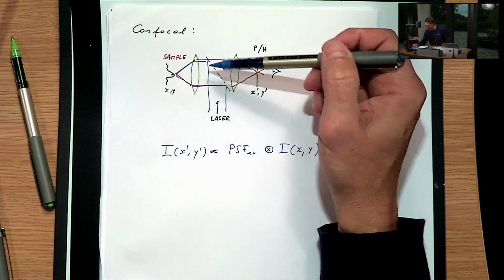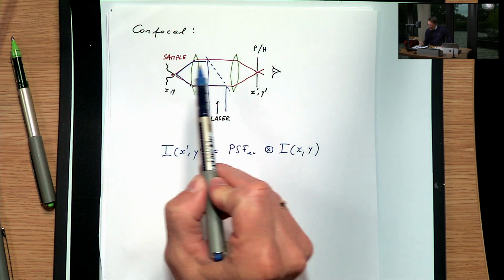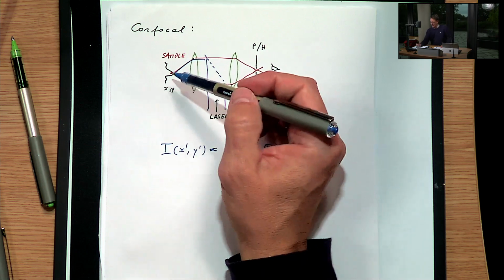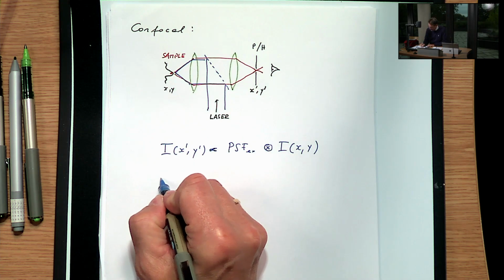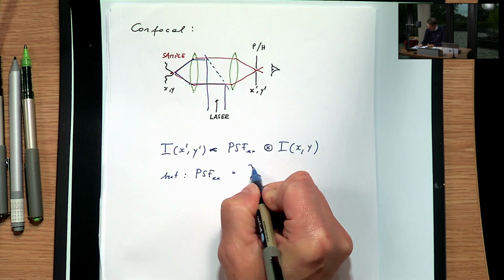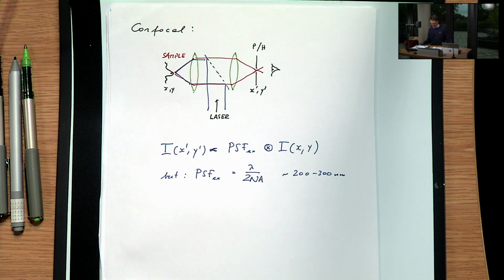So the point is, of course, that in confocal imaging, you raster this point across the sample and you record the intensity as a function of time. And so the time trace, as you scan across the sample, gives you what is called an optical section from a certain plane that is in focus with the pinhole. So it's this optical sectioning capability that improves contrast in confocal, as we've described in earlier lectures. However, the PSF of the excitation is lambda over 2 NA, and so it is between 200 and 300 nanometers as usual. So it is normal diffraction limited.